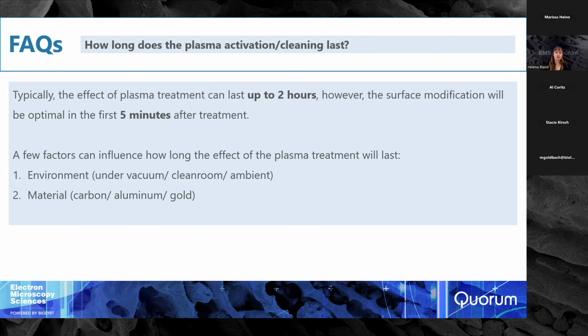The material will also affect how long the plasma treatment effect lasts. And finally, of course, the plasma treatment conditions you use. As I mentioned earlier, if you're using a very high power, doing a very aggressive clean on the surface of your sample, this will last longer than if you are doing a very gentle clean.